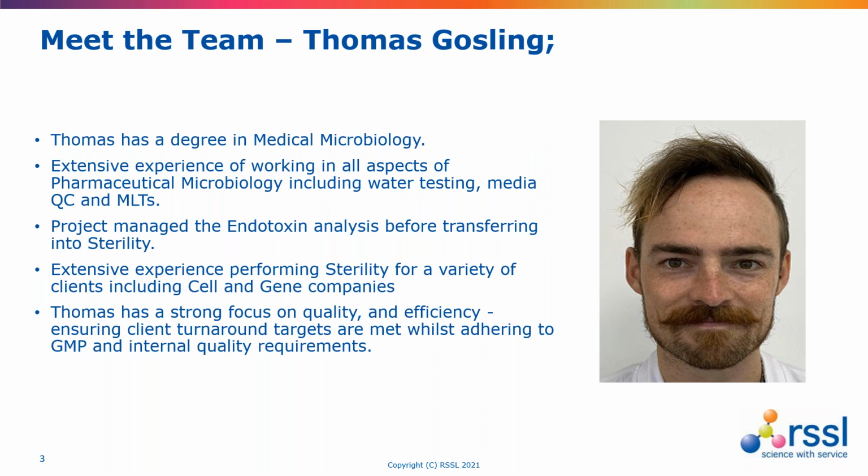Excellent. So what does a normal week look like for you at RSSL? So it begins with setting up the isolators for use and scheduling the workload. The role is heavily laboratory based with testing and releasing products, and this is broken up with client calls and updating processes and things like this as well. The dynamic and variable workload keeps us on our toes, and we have to deal with a fluctuating workload and also the technical problems that can arise when dealing with finely tuned pieces of equipment such as isolators.